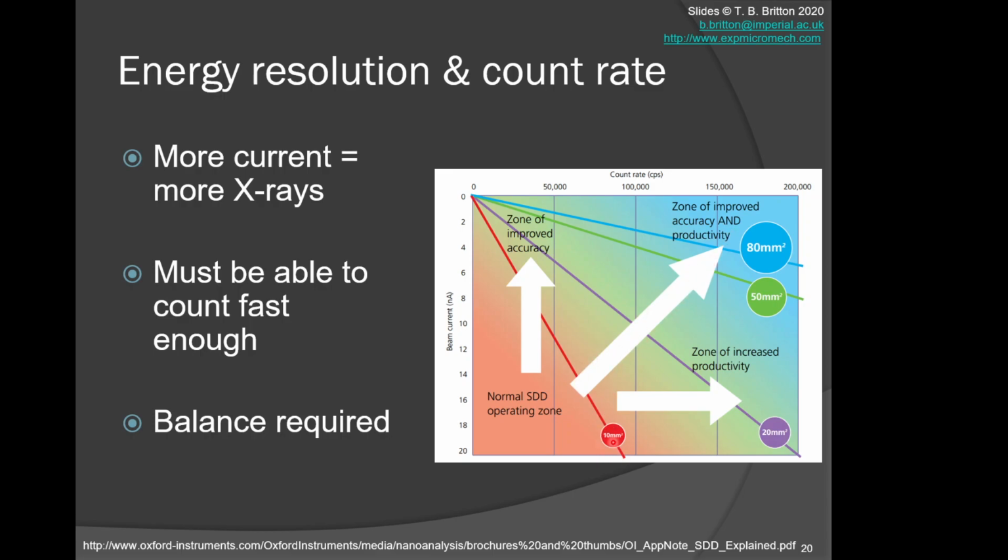This thing costs probably about 10 times less than this thing over here, and so there are a lot of choices to be made. And also, the majority of analysis that people want to do can be done with a few point analyses. You don't often need these very fast, very expensive, and sometimes actually very noisy spectra detectors for the large area systems.